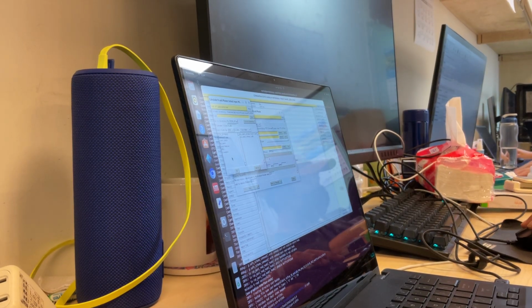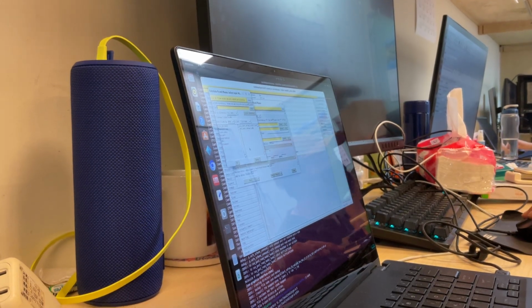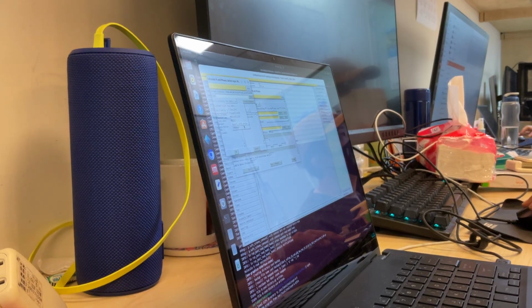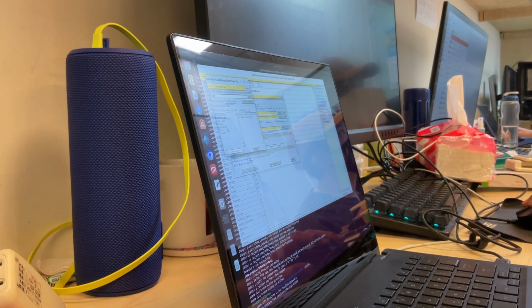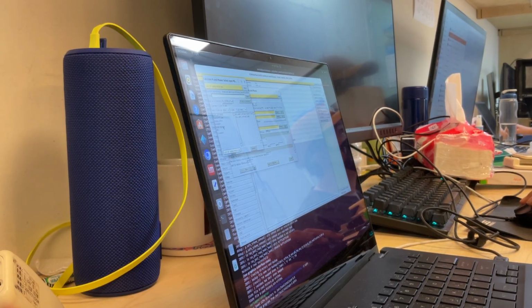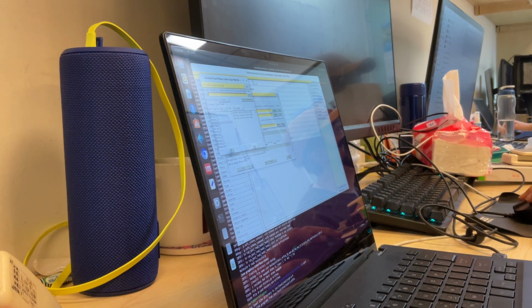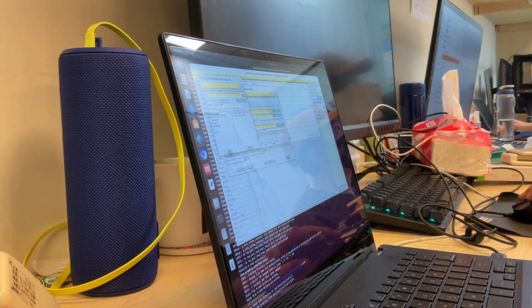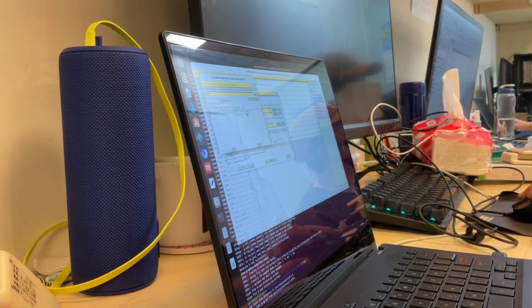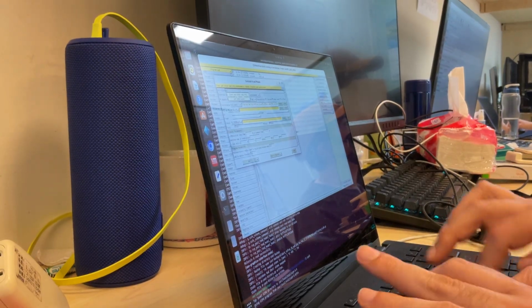Okay, so where's the initial data? Is it all dark, or what is it? So what's the dark MTZ file? So we need to go here like this. Yeah, we're here. Okay, where's the dark MTZ file? All dark, and then this is the PDB file. Wait, yeah, this is the PDB file. So we go all dark and we go refine 28 and we go for this one, the no H one, isn't it? Yeah. So wait, let me write it here.